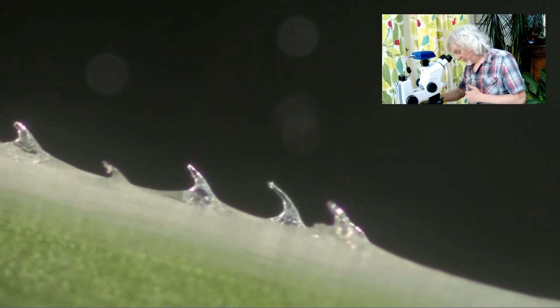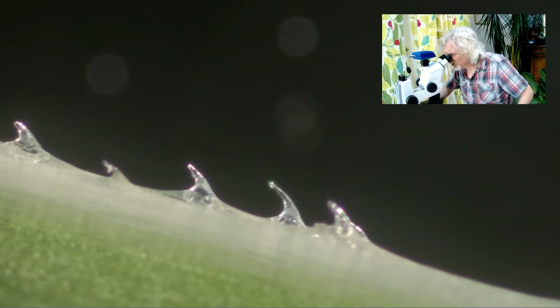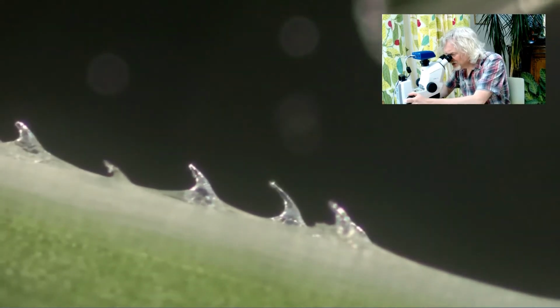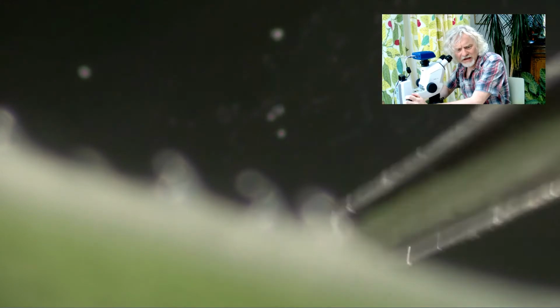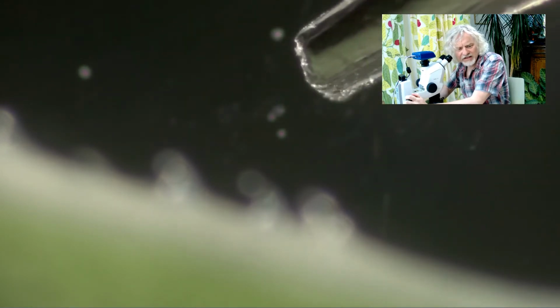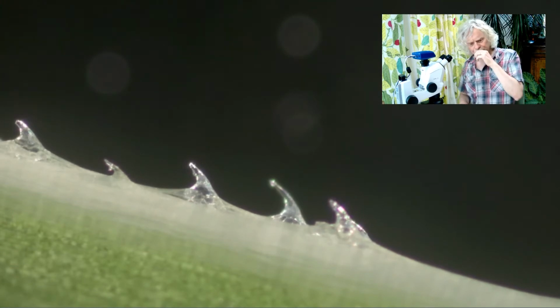So these hooks here, if I now put my needle in next to them, where are you? Where is the needle head? If I put the needle head in, so there is the head of the needle behind. Can you see that? Okay, so that needle there, this is a sharp needle that will sort of pierce straight into me. I've jabbed myself with this needle many, many times. It's very difficult to actually get it to hold still. But you can see it's completely blunt compared to these hooks. So the hooks are really, really sharp.